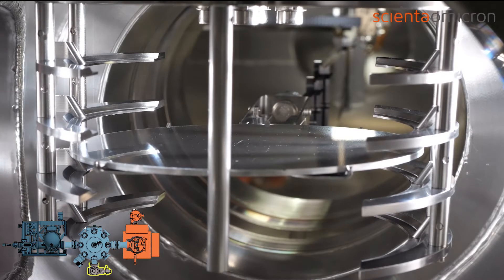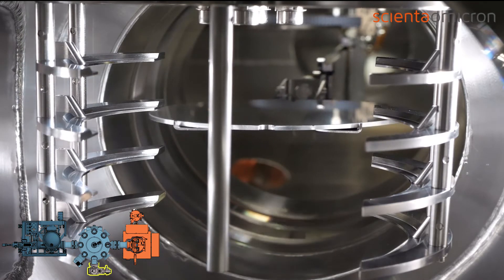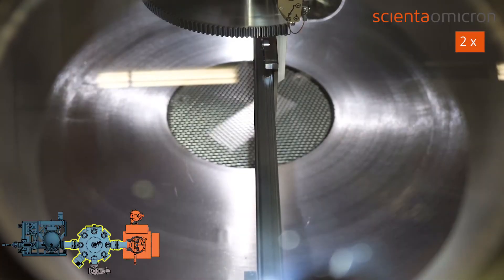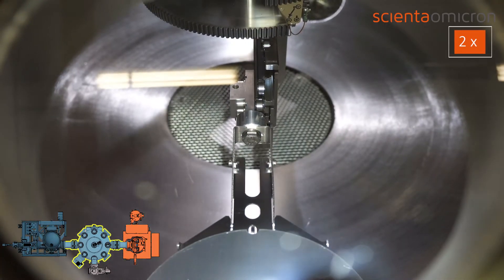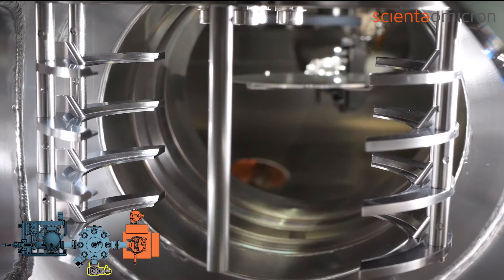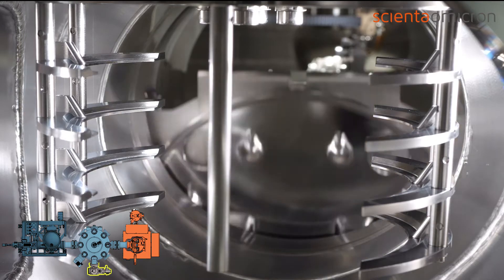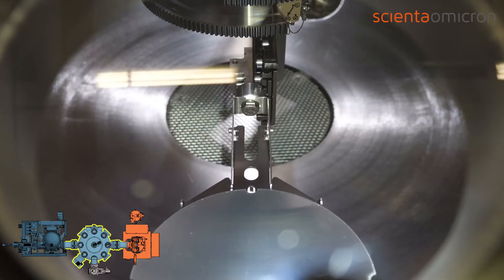The storage is then repositioned to a valid height to retract the robotic arm into the radial distribution chamber. When the arm is retracted, the UHV gate valve will close, and with that the unloading process is completed.